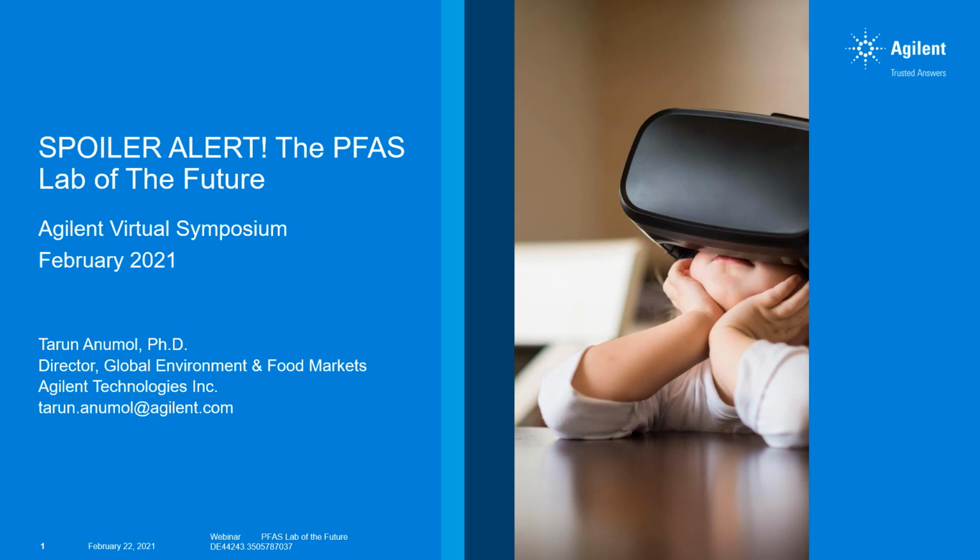My name is Tarun Anumol and I'm the Director for Agilent's Global Environment and Food Markets. I want to spend the next few minutes talking to you and looking into the future about the PFAS lab of the future. So I want to talk a little bit about what labs in the future that are doing PFAS analysis actually will be doing and how they can maximize and optimize efficiency and throughput.